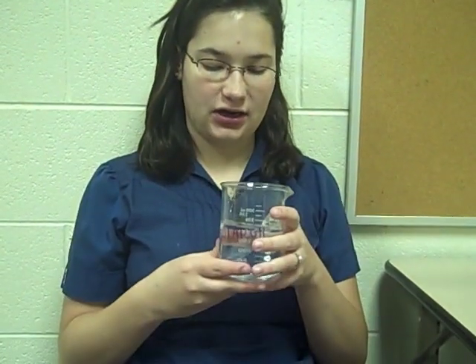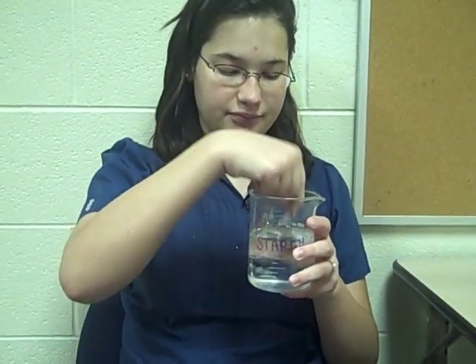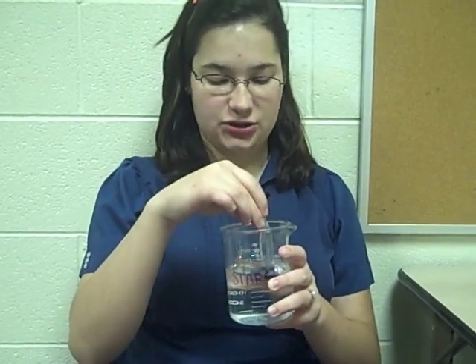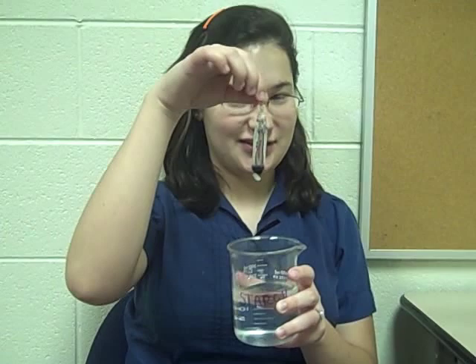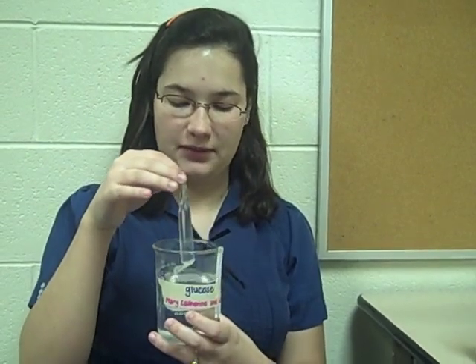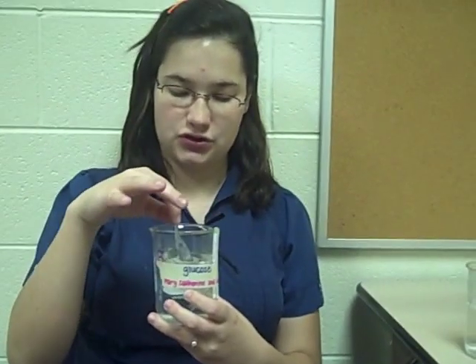We found that the results were that for the starch, the iodine diffused into the cellulose tubing, and so we were wrong because we thought that the starch would diffuse, but the iodine diffused into the cellulose tubing. And then for this we were right. The glucose did diffuse out of the cellulose tubing and into the solution, so the two solutions became isotonic.